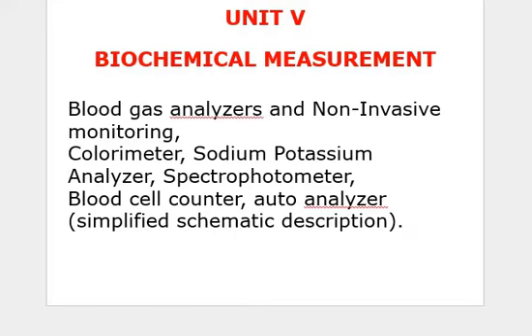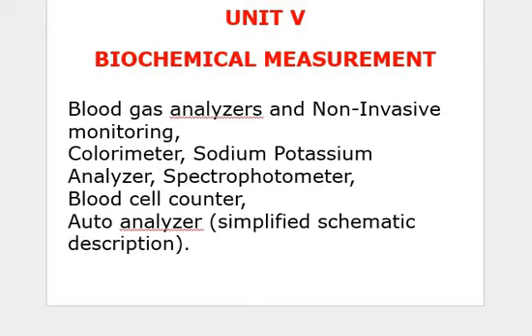What are the chemicals that consist in our body? How can these chemicals be measured? Very important point. First we are going to discuss the colorimeter.